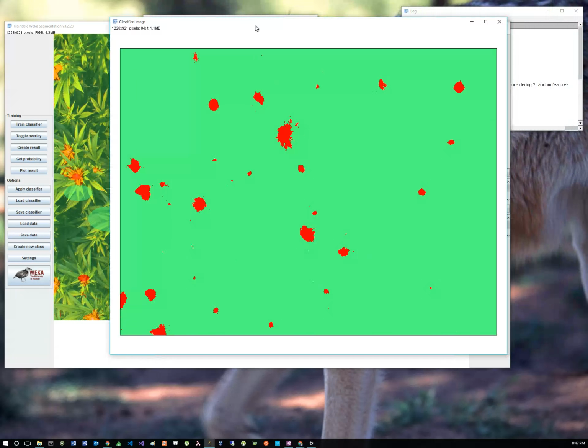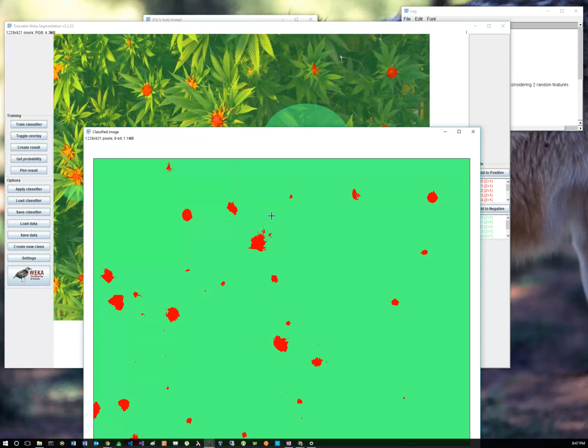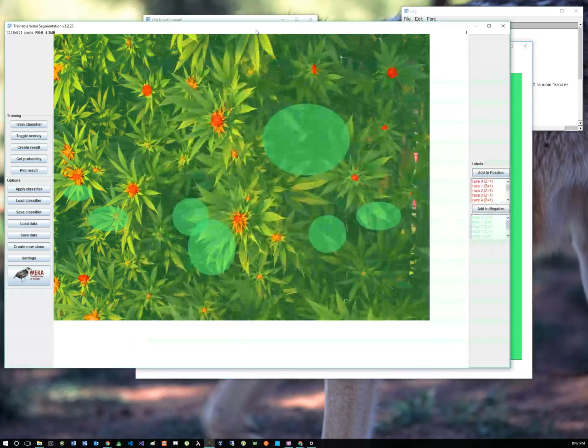Let's make sure we've gotten the entire image. Maybe remove something here. This is too big, right? And we're now ready to save it. So we saved the image into the masks folder.